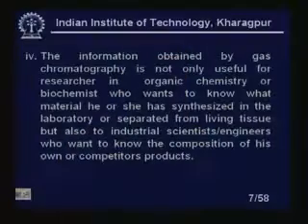That is the reason we are discussing it in this course on industrial instrumentation. It has tremendous application in industrial instrumentation, where we need to know the composition of gases. It is a very important parameter in many situations, for your own or competitor products. Suppose an unknown product is coming and we do not know the composition. With gas chromatography we know not only the percentage, but also the different gases present.